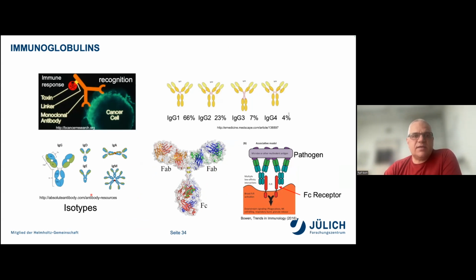In this case, we used a powder from Sigma that contains IgG, but there we already have four subforms, where the majority, 60%, is IgG1 and 20% IgG2, which are a bit different in the bonding. IgG1 has 2 disulfide bonds, IgG2 has 4 disulfide bonds. So there's a small difference, but in general we assume that the structure is quite the same.